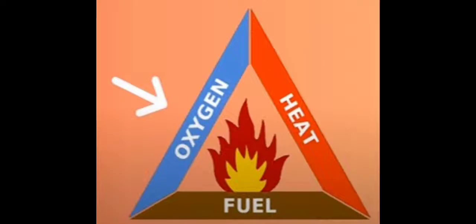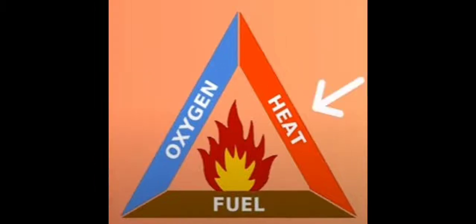First, oxygen source: approximately 16% is required. Normal air contains 21% oxygen. Some fuels contain enough oxygen within their makeup to support burning. Second, heat source, to reach ignition temperature: open flame, the sun, hot surface, friction, chemical action, electrical energy.